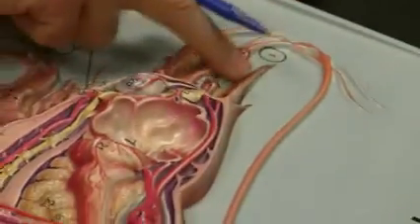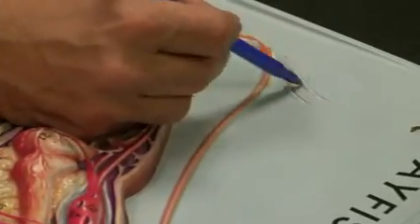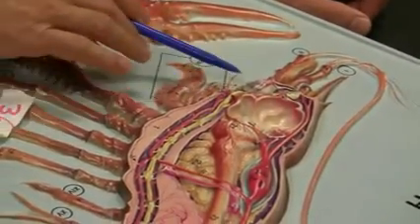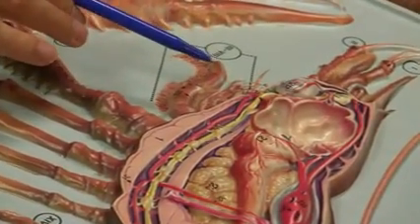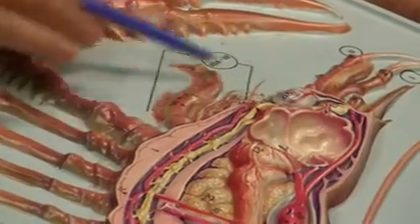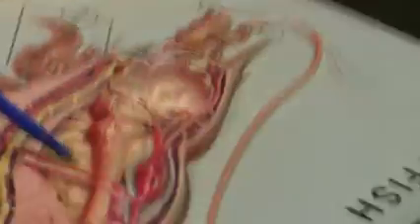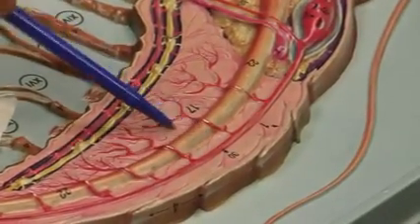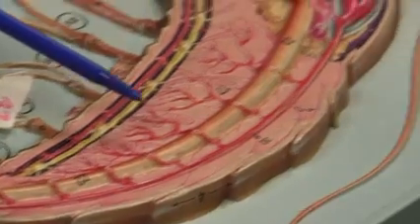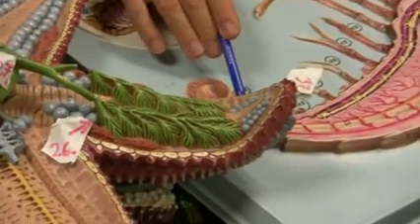Okay, rostrum, antenna, antennule. Is that right? What kind of animals are they? They are mandibulate animals. Remember, they have mandibles in here. Okay. Stomach, gonads, intestine, flexor muscles. Some of them are extensor, some of them flexor. Okay. Uropod, telson, anus. Right here.